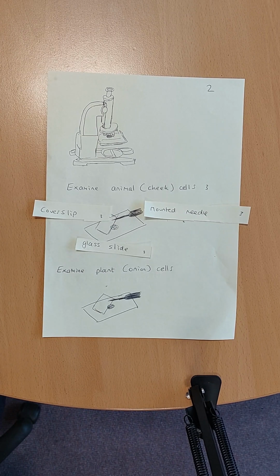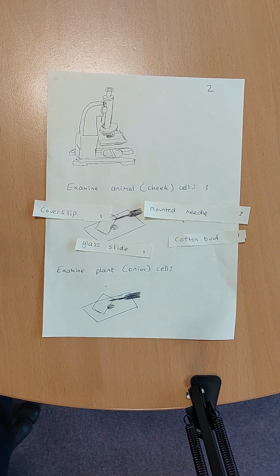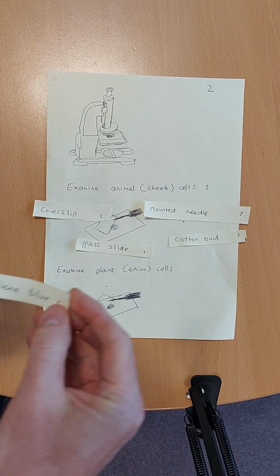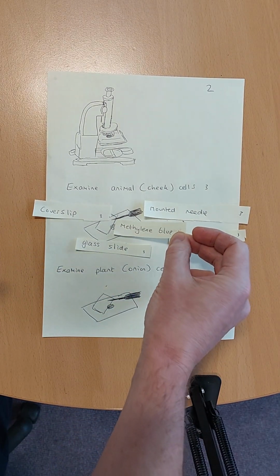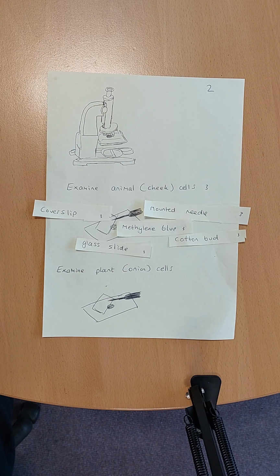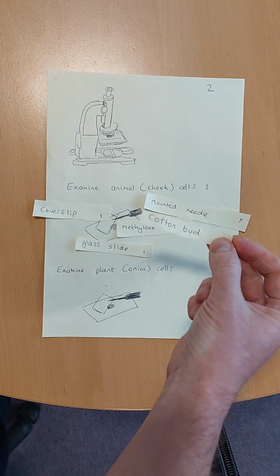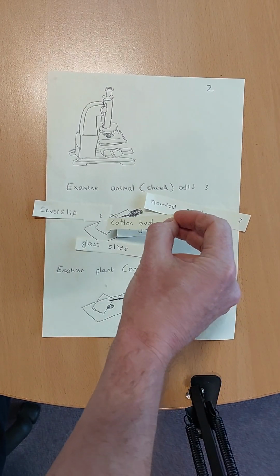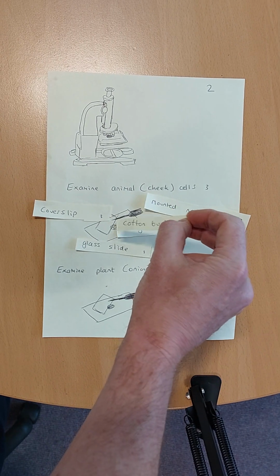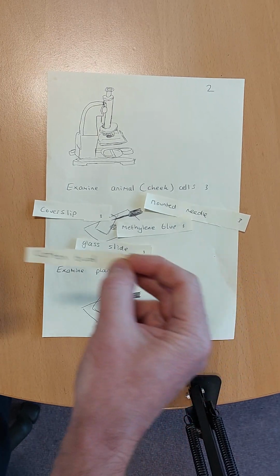First thing we need to do, if you're doing this experiment, is use a cotton bud and rub it inside your mouth, on your cheek, to pick up some cells. What you would do then is put something called methylene blue onto the glass slide. You could then take your cotton bud, and you'd rub it in the methylene blue, and that would get some of the cheek cells in the methylene blue, so we can then look at them under the microscope.